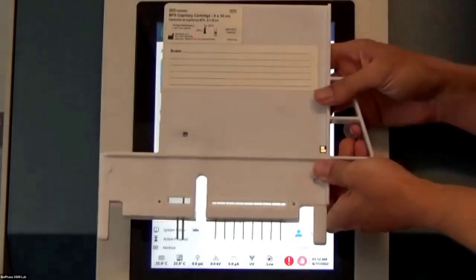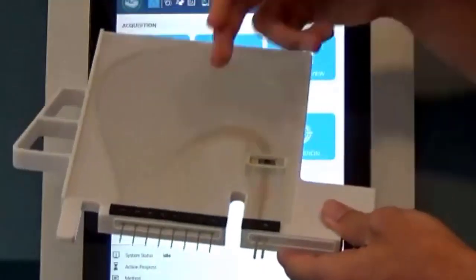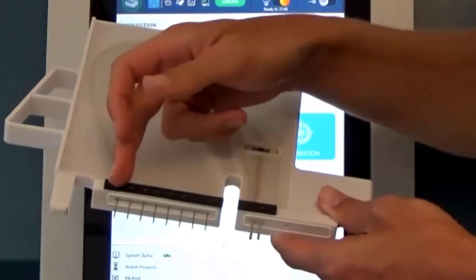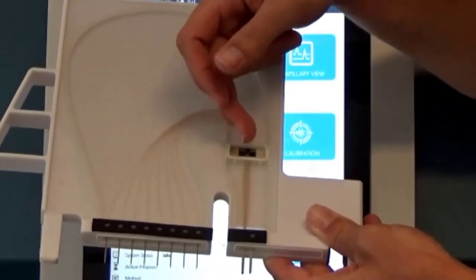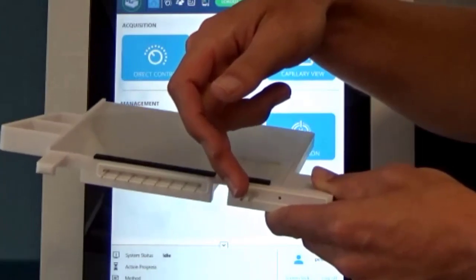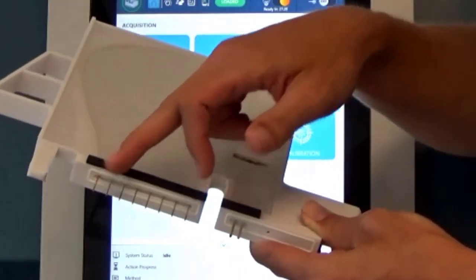Here, we take a look at our capillary cartridge. It's going to look a lot different than those of us that are used to the PA 800 Plus system. We have 8 individual capillaries here on our inlet side. Each one has its own independent electrode, and we can see all 8 capillaries are going through. Here we have our detection window, and then on the outlet side, they're all bundled together. So it's still 8 independent capillaries, all 8 independent outlets, but all in one location. On the outlet side, the electrode is positioned right next to it. On the inlet side, these have 8 individual electrodes.